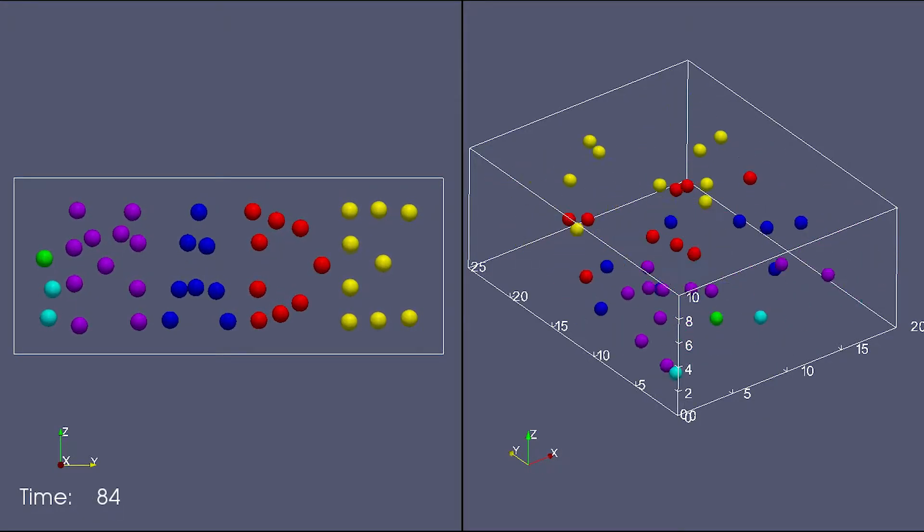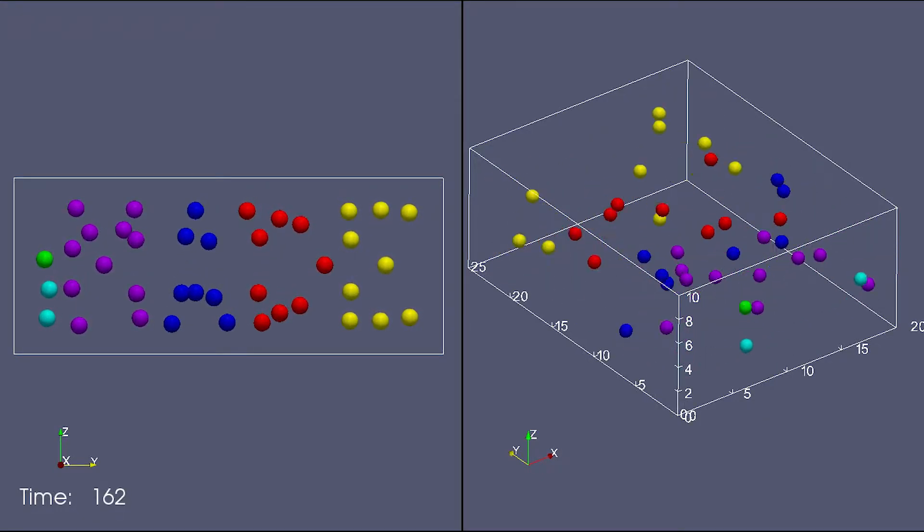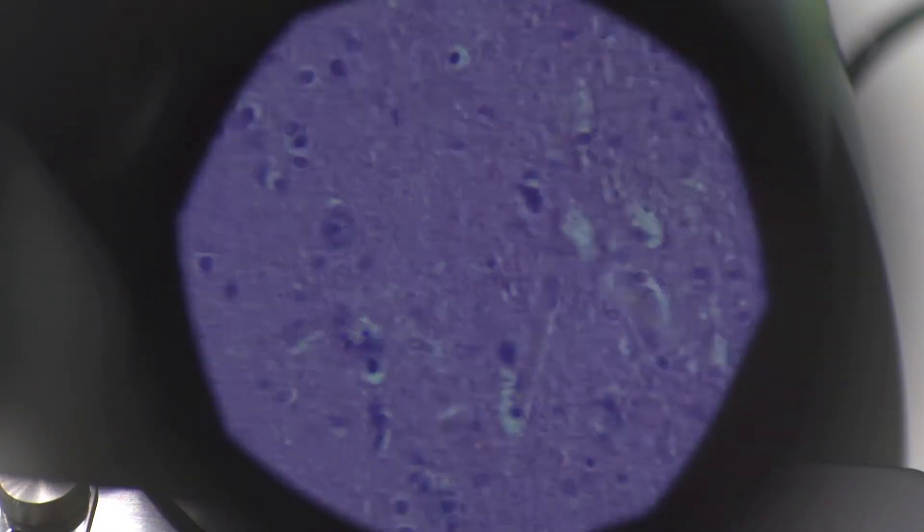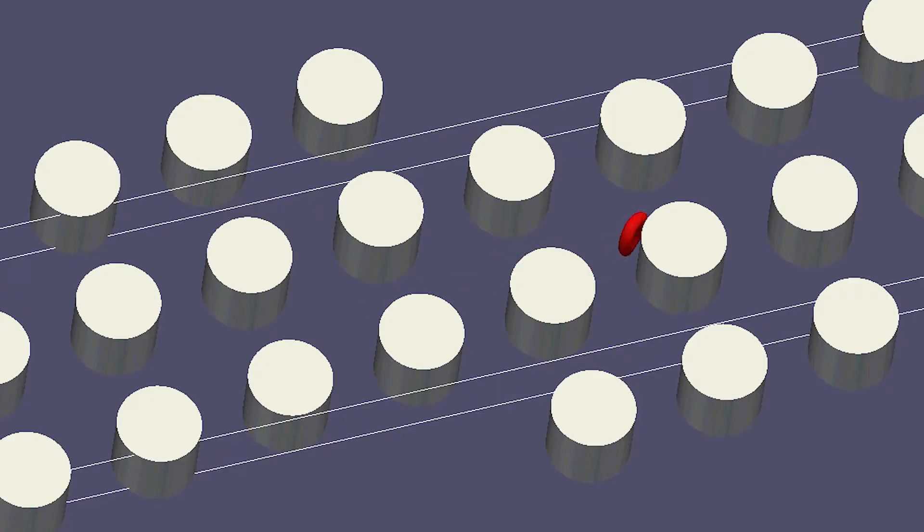iMADE lets users change the flow dynamics within the microchannel and also allows users to input cell types with different properties, mimicking real cell flow within a microfluidic chip.